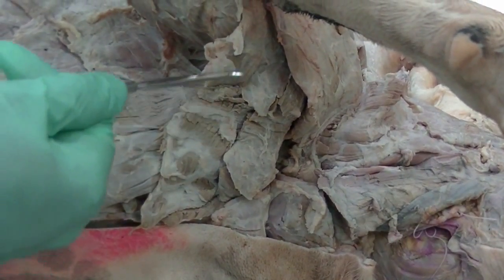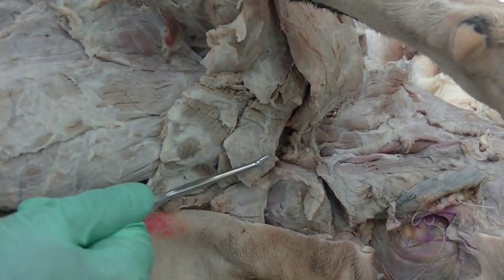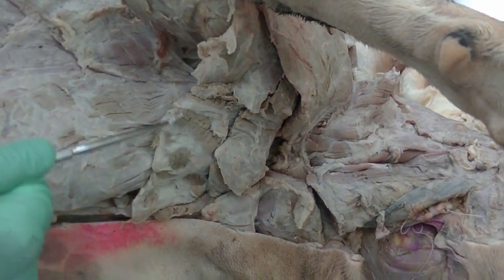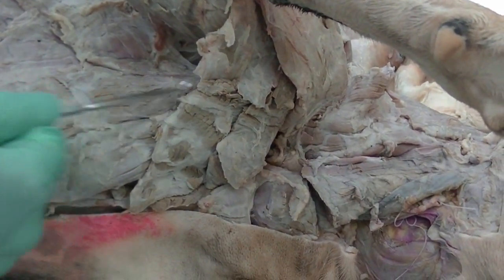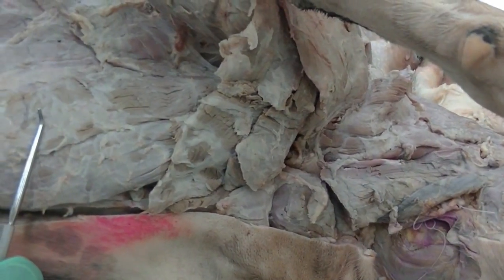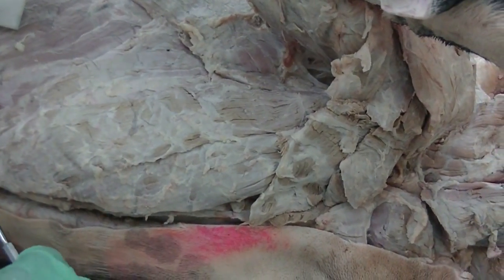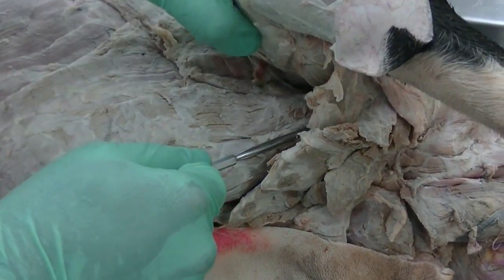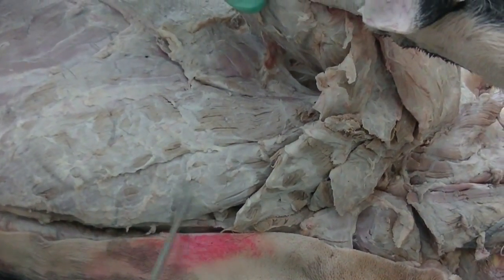The transverse pectoral along with the descending pectoral, as they are located more superficially, are combinedly called superficial pectoral. As we move further backward, we see the larger muscle which originates from the sternum and gets attached to the humerus, close to the proximal end of the humerus in the shoulder region. That is the deep pectoral muscle.